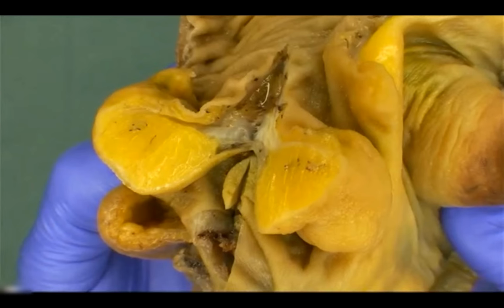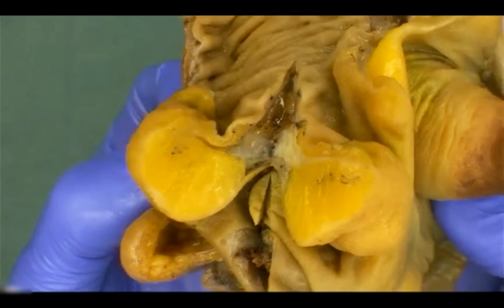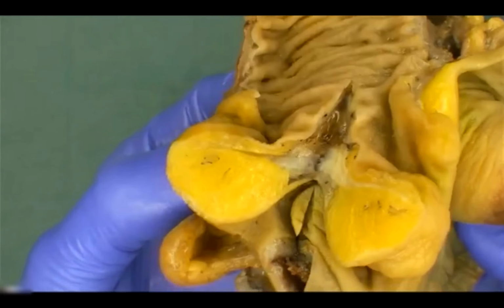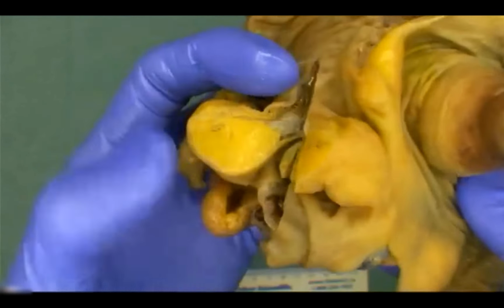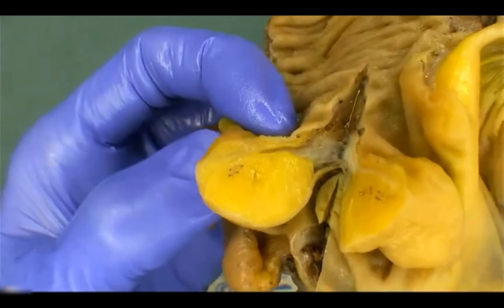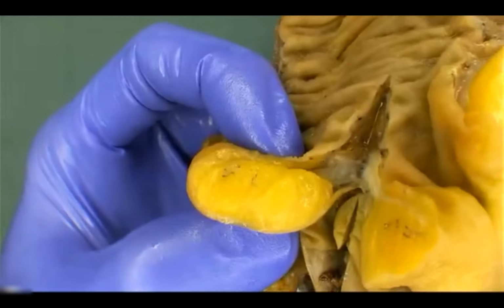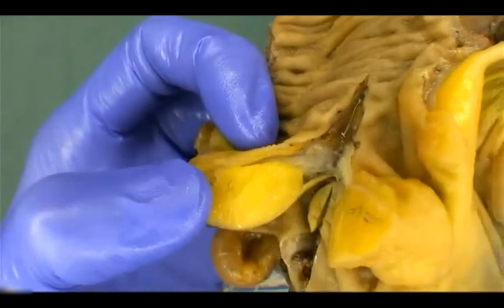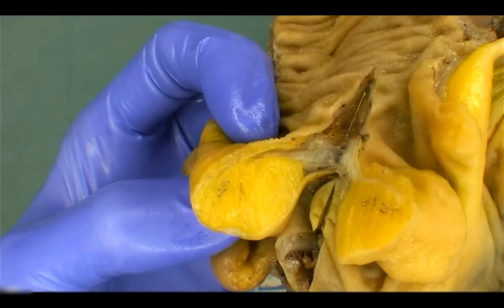Homogeneous, great. Fatty and homogeneous, lemon yellow, I like it. Okay, so common things being common and entities looking the way they're supposed to, this is probably some type of submucosal lipoma. Caseous, not quite. We'd expect more white and some chalkiness in coloration. This is very homogeneous and texture-wise, it's very soft. If something was caseating, we'd expect it to be a little bit more friable and, using food eponyms, cheesy.